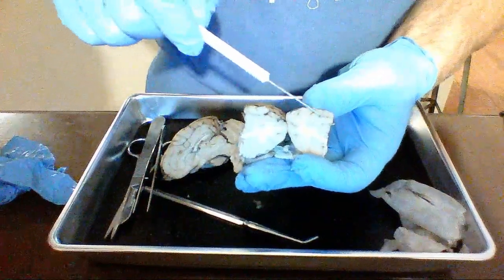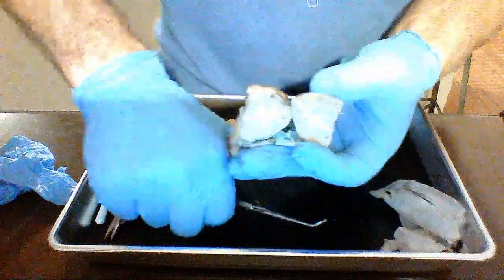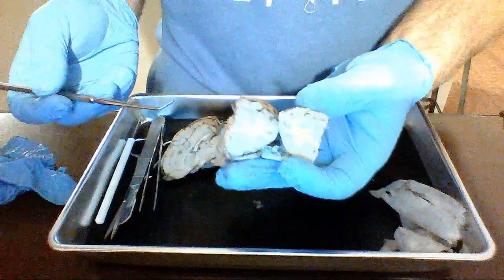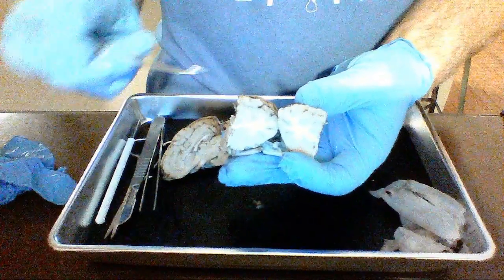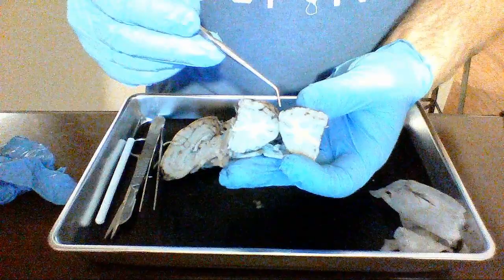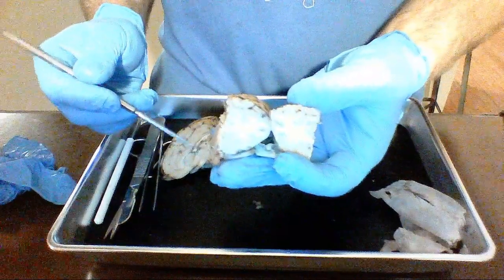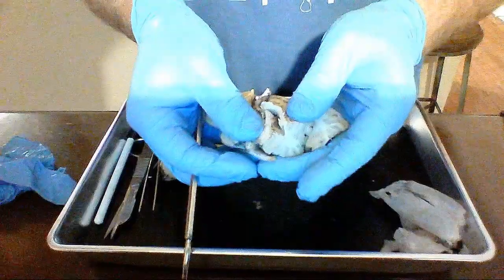That is your cerebral cortex. That's where you've got your neuron cell bodies doing processing. The lighter portion is white matter. That's where you've got myelinated axons. So the darker portion is gray matter. The lighter portion is white matter. The edge is cortex, and because we've got those ridges and grooves, the gyri and sulci, we've got increased surface area for more of those neurons for processing. And then we can see inside our lateral ventricle very nicely.